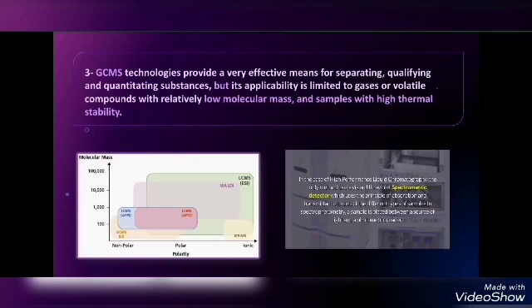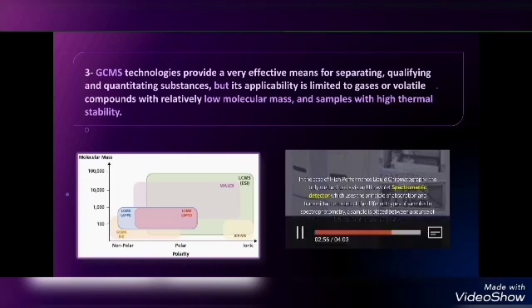In the case of high-performance liquid chromatography, the only method used is via an ultraviolet spectrometric detector, which uses the principle of absorption and transmittance to detect the different types of samples. In spectrometry, a sample is placed between a source of light and a photometric reader.